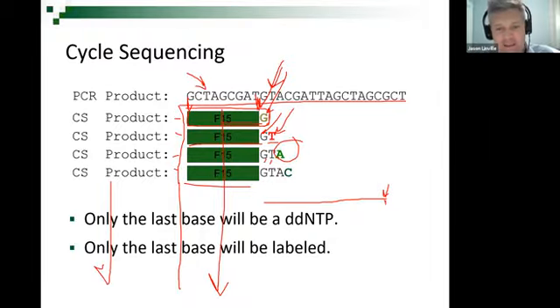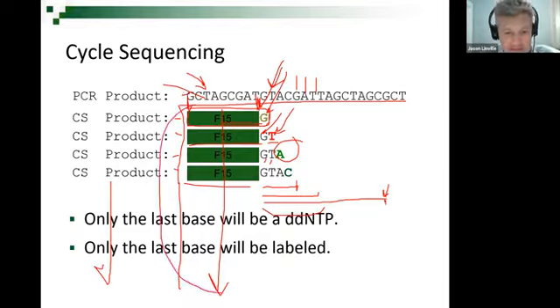But it stops. So can you guys picture this? Like picture it continuing. It's now 4 normals and it stops at a G, okay? Then 5 normals and it stops at an A. Then 6 normals and it stops at a T. And one cycle through, you start with 1 million copies of DNA, you wind up with 1 million of these, okay?